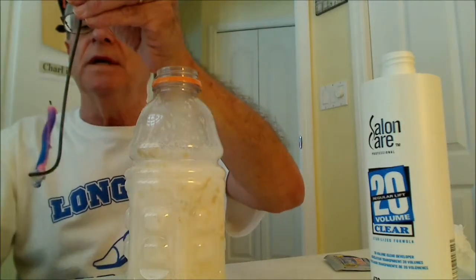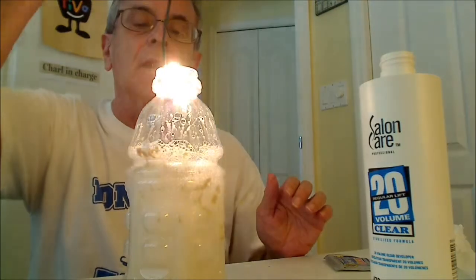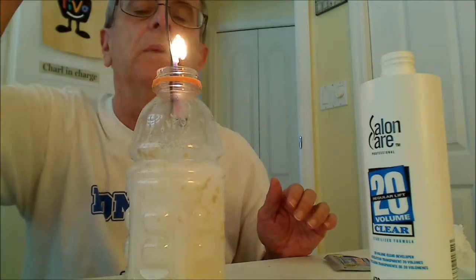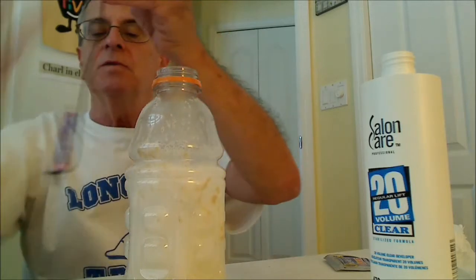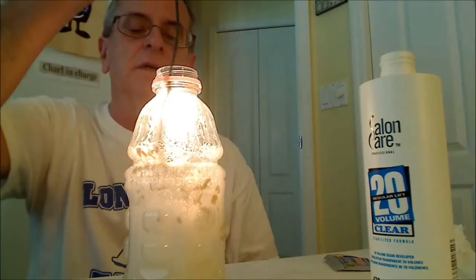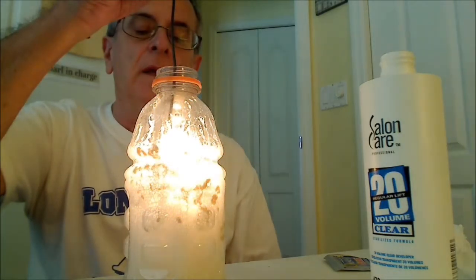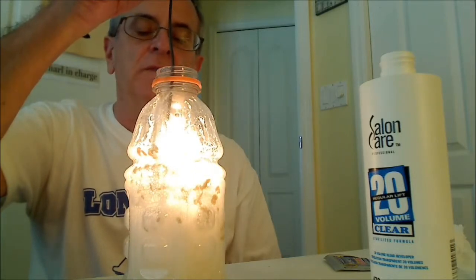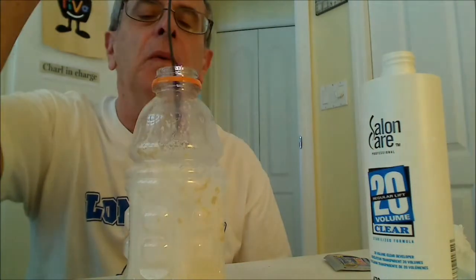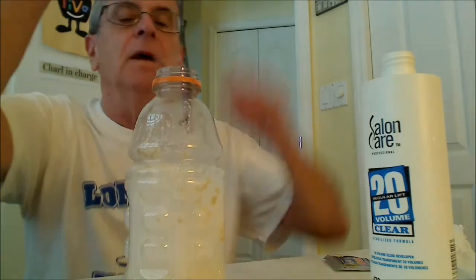It doesn't glow like a splint, so sometimes you don't get the glow. But it certainly is very much brighter because of the oxygen produced. But I can't get it to reignite. I have been able to do it. The splint works better, but it is sometimes hard to find, and also it produces a lot of smoke and smell. It's hard to blow it out.